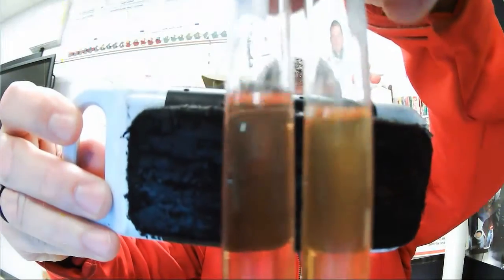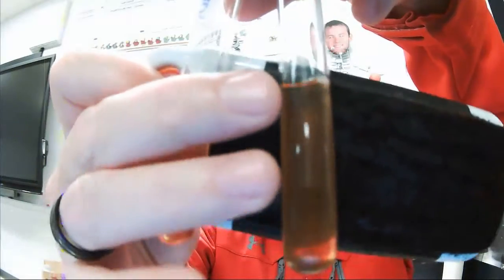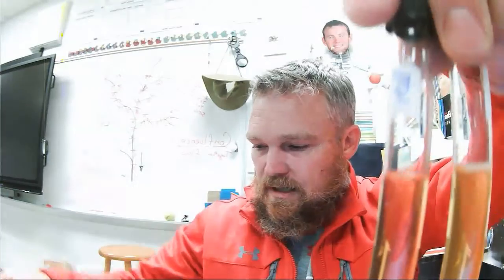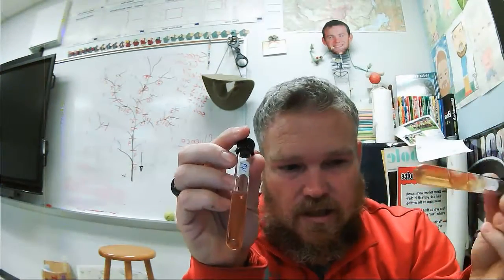So let me do that. You can tell if I do that. Let me do it this way. This one is the one that came back as questionable, and then what we decided to do is make sure that it wasn't just user error on the first one, contamination.